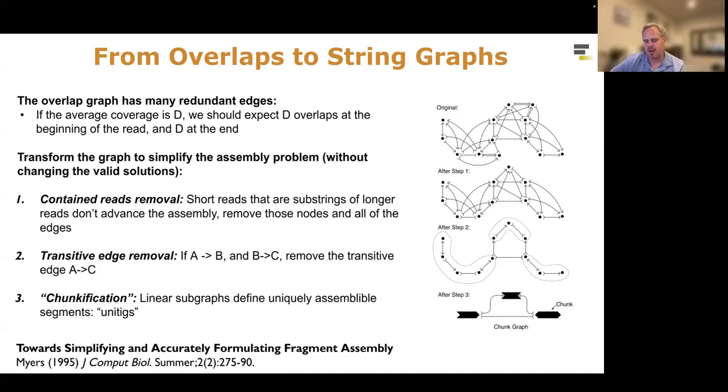But then, similar to the De Bruijn graph assembler, you're going to need to overlay some sort of long range information. It could be Oxford Nanopore long reads. It could be Hi-C data. It could be optical mapping data. It could be a genetic map, some other information to take your initial contigs and lay them out into complete chromosomes.